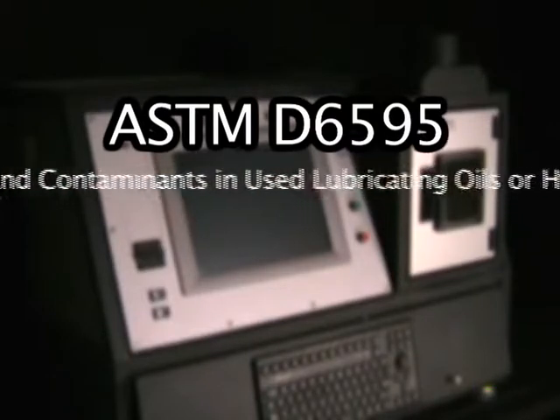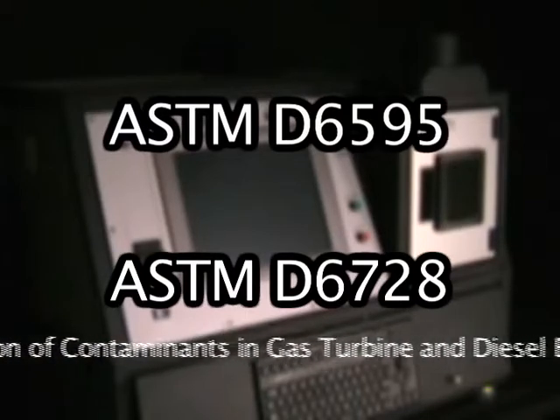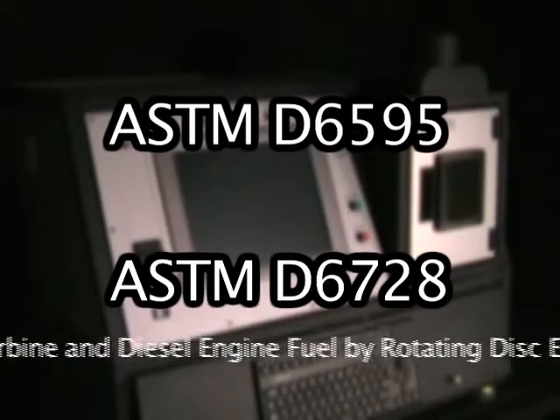For used oil analysis, it fulfills the requirements of ASTM 6595, standard method for determination of wear metals and contaminants in used lubricating oils or hydraulic fluids by rotating disc electrode atomic emission spectroscopy. And for fuel analysis, it meets the requirements of ASTM 6728, standard test method for determination of contaminants in gas turbine and diesel engine fuel by rotating disc electrode atomic emission spectroscopy.